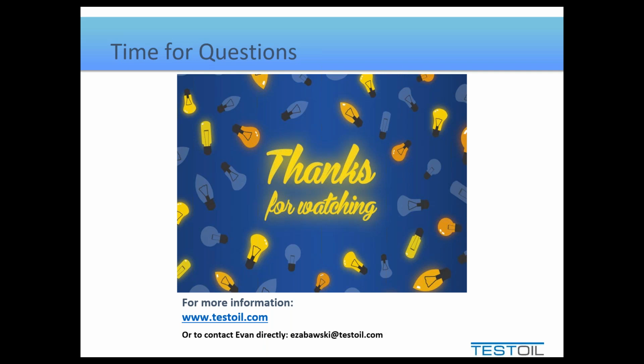So is there an alarm limit for elements to identify the severity? Short answer to that question is no. The reason for this is there's too many variables to suggest that, as an example, 100 ppm is severe. 100 ppm in 5 gallons of oil is less than 2 fingernail clippings worth of iron. 100 ppm in 50 gallons of oil is about 3/4 of an ounce of material. 100 ppm in 500 gallons of oil, on the other hand, is nearly half a pound of material.